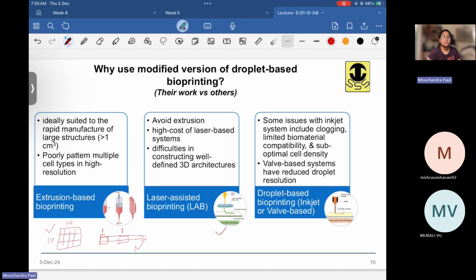But shear thinning materials have the property to reduce their viscosity. If the viscosity is reduced under shear, then the cells can flow better through the tip of the nozzle, and the stresses they experience are much less. So that is one way, all right? But yes, you cannot fully avoid shear stress in this technique.